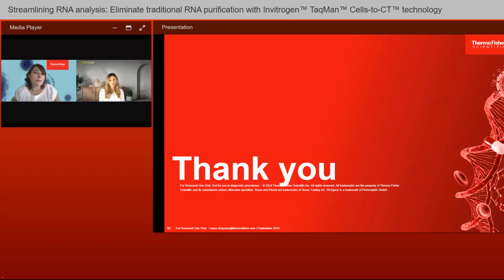And then also you could use the control kit to make sure that you're getting that cell lysis efficiency, that it's being 100% lysed, and that you're not seeing any inhibition. That xeno-RNA would be able to indicate that as well, and also help you really determine the maximum input and the minimum input. Minimum is usually by looking if your gene of interest is detected or not. The maximum input would generally be because of inhibition or incomplete lysis. And so the combination of that pilot experiment and using the control kit would really help you answer that question the best. So the answer is it depends.